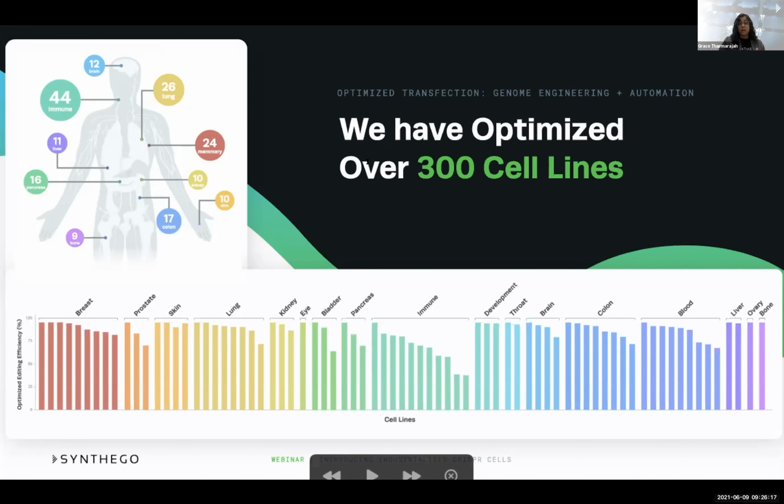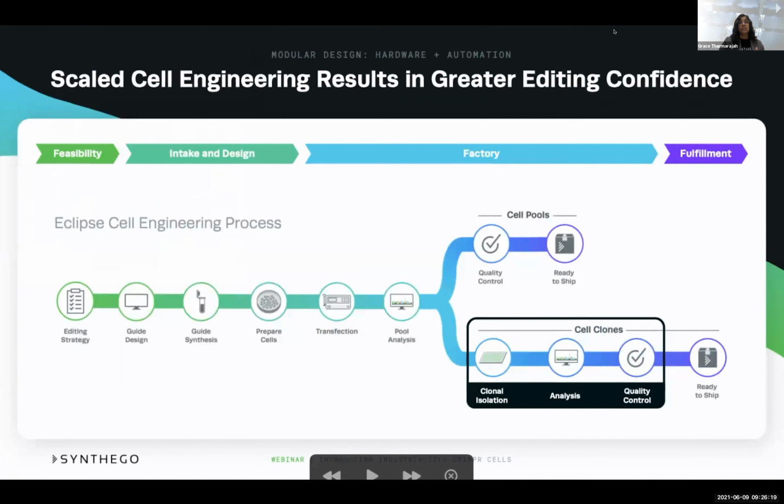So we spent some time on transfection. In addition to transfection, another important module in our workflow is clonal isolation. That's been highlighted at the bottom there, so we're turning back to that slide you saw earlier. That process itself includes not only clonal isolation, but analysis of the clones, as well as ensuring that the clones are of good quality prior to having those passed on to our researchers for downstream assay purposes. Let's spend some time looking at clonal isolation in a little more detail.